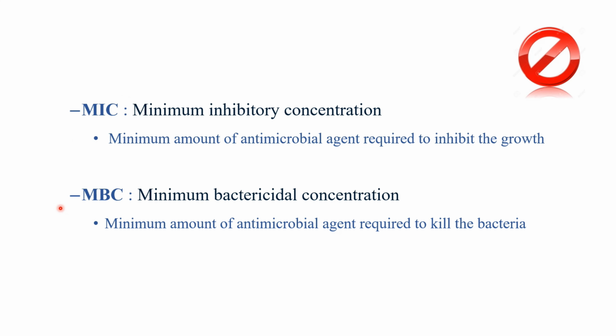MIC and MBC. MIC means minimum inhibitory concentration. That means the minimum amount of antimicrobial agent required to inhibit the growth of a particular organism. Minimum inhibitory concentration means the concentration that will inhibit the growth of that particular organism.